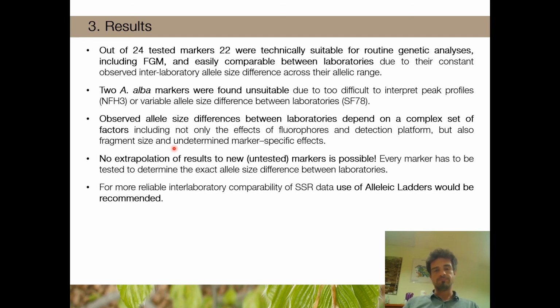Because of that, if we wanted to implement genetic monitoring on a larger scale involving more laboratories, analyzing thousands and thousands of samples, it would be advisable to use allelic ladders instead.